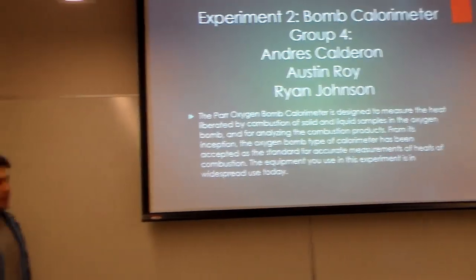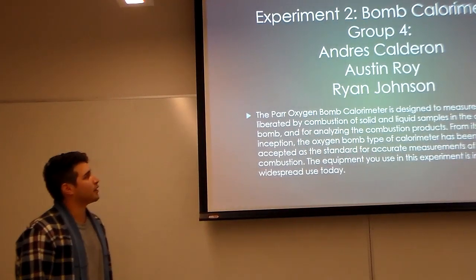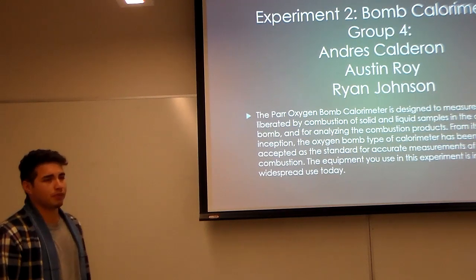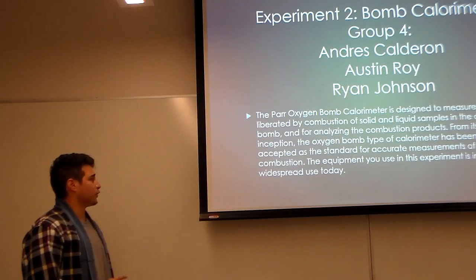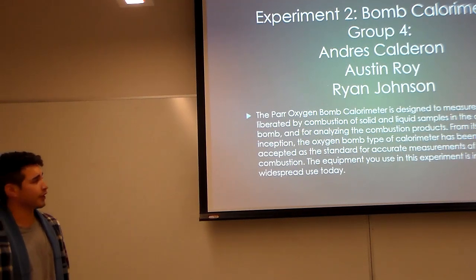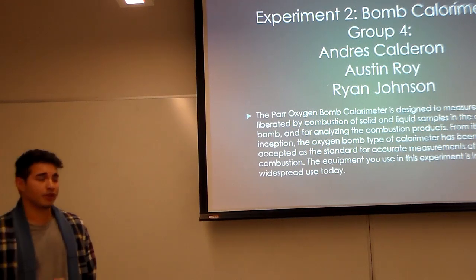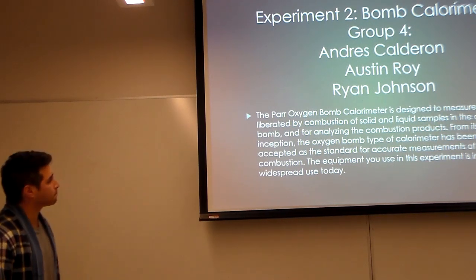Hello everyone, my name is Calderon, and today we'll be talking about the bomb calorimeter. The oxygen bomb calorimeter is used to measure the amount of heat released from the combustion of a solid or a liquid sample in the oxygen bomb. This oxygen bomb is standard, so it is in widespread use today.